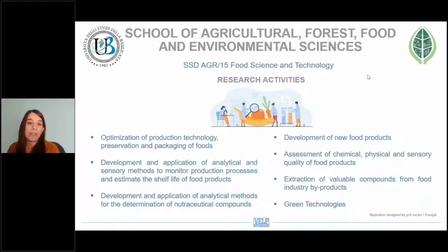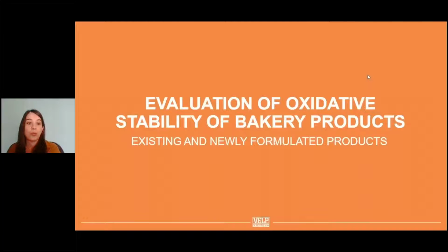So within this expertise, Oxitest by VELP Scientifica helps us in our daily tasks. In this presentation, I'm going to shortly explore some of the applications of Oxitest in our lab. Let's start with some examples on bakery products.